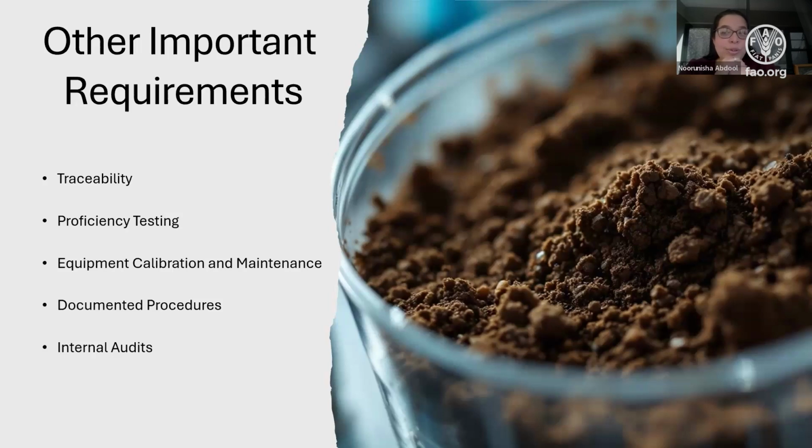Okay, Joseph extensively went through equipment calibration and maintenance. Thank you, Joseph. I do not have to discuss it again. But keep all of your maintenance records, keep all of your calibration records. Whether you calibrate once a day or you calibrate once a week, write it down, even if it's just a logbook that you make a note of these things. Put it on Excel, my favorite, and then it's stored forever and you have trace of this.